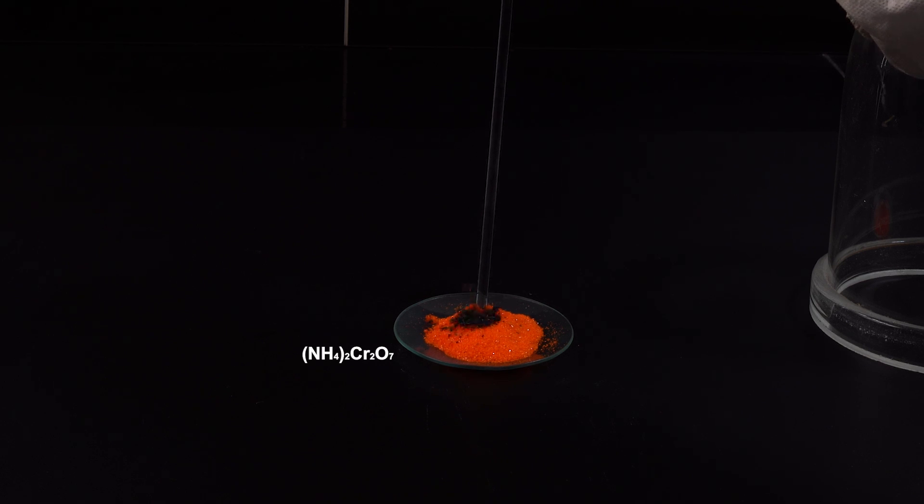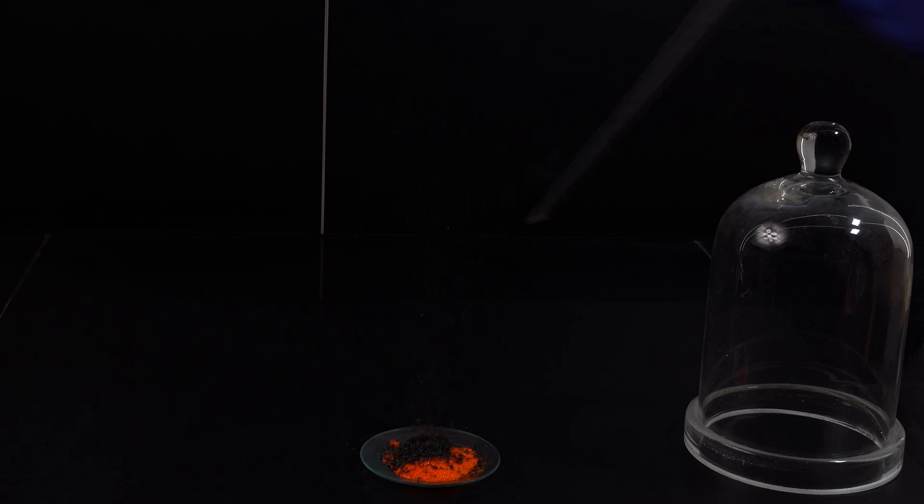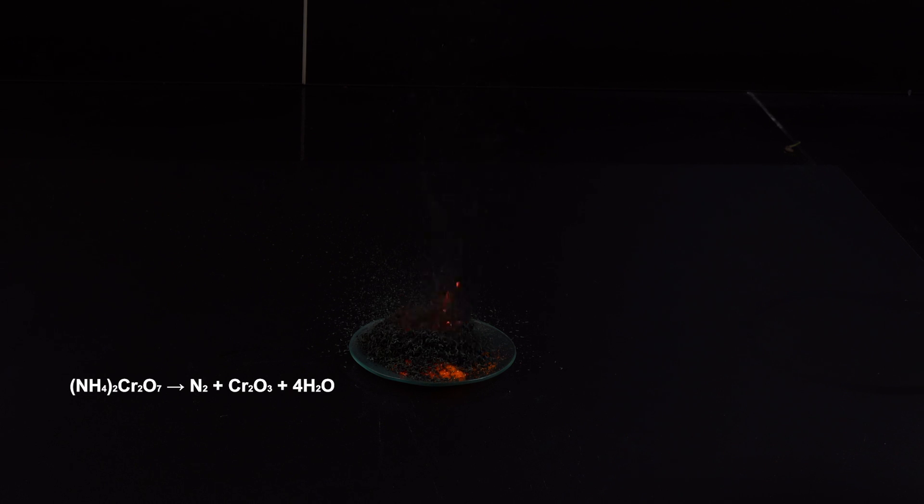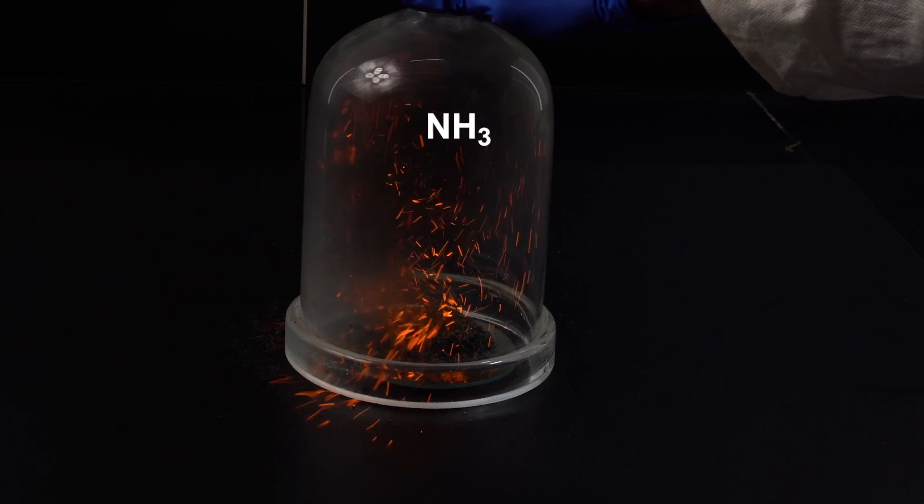Hey guys! You probably know the reaction where ammonia is oxidized by air oxygen in the presence of red-hot chromium oxide when decomposed ammonium dichromate, in which chromium-free oxide forms, is placed in the ammonia atmosphere.